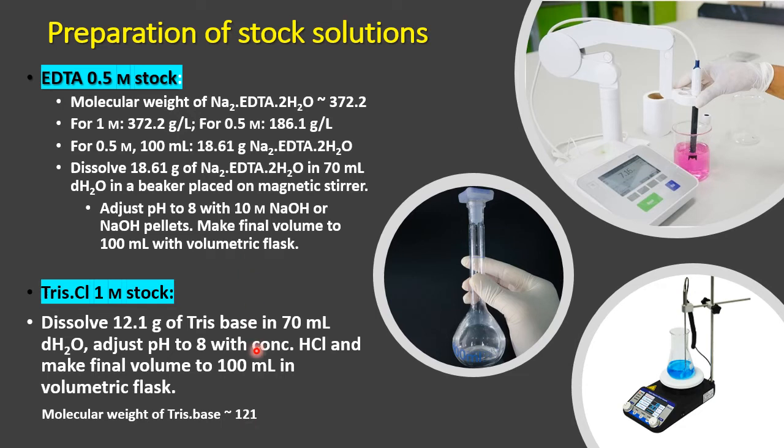You always have to make these solutions separately. If you have one solution in which 5 ingredients are there, you have to make 5 stock solutions separately, and then finally you can combine those. So of course a lot more effort is there, because you have to follow this procedure. But otherwise, for the substock solutions and for the final concentrations, there are some calculations followed by simple dilutions.